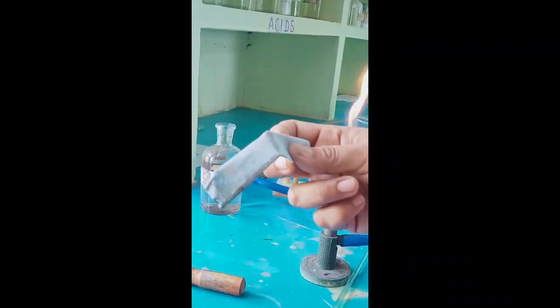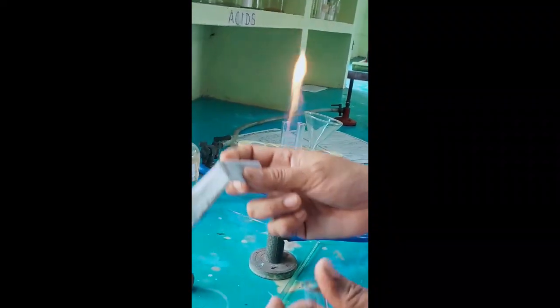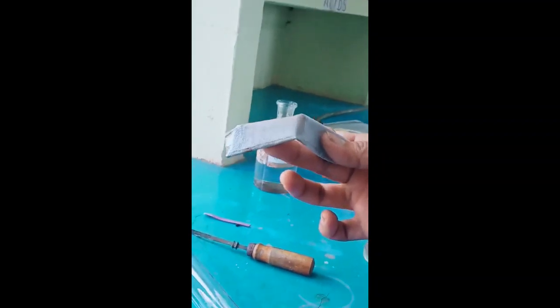So there are 4 tests. One is the rotten egg smell, a gas with a rotten egg smell. Another one is lead acetate paper turns silvery black. And also this colorless gas turns acidified potassium permanganate from purple to colorless and acidified potassium dichromate from orange to green with the deposition of yellow particles of sulfur.